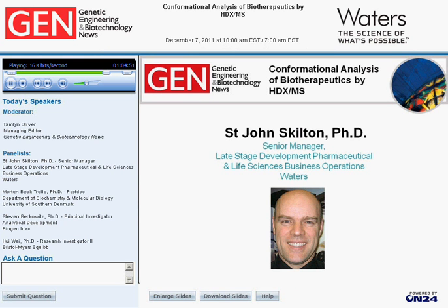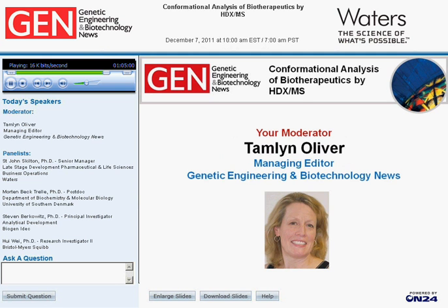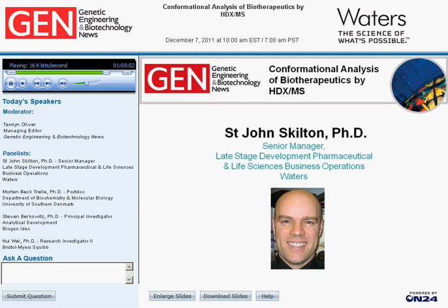Okay, and what's the purpose of using the cold box? The reason we developed that is because it's one of the ways in which you can cope with back exchange. So back exchange is the reversal of the deuterium uptake, and you want to try and control that so you can lock in the picture of what you've got, to take that snapshot. And the ways in which it's done in solution would be typically through pH regime, so you quench through pH, and by keeping it cold, you also manage that back exchange very effectively to try and minimize it or get rid of it completely if you can.